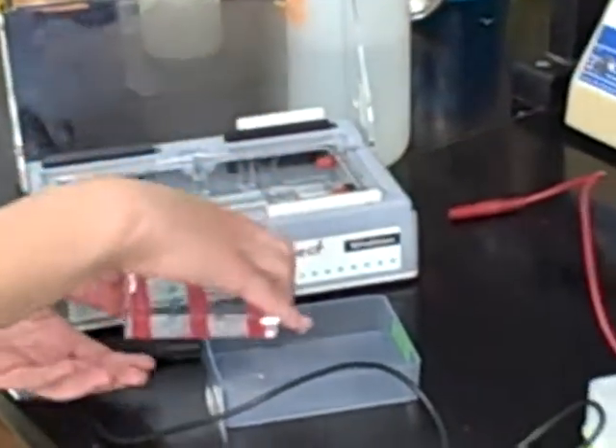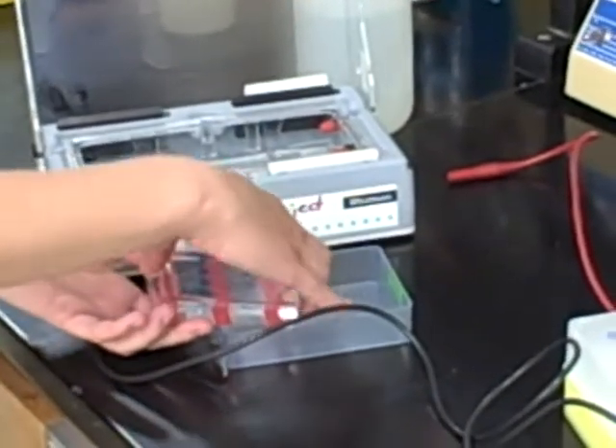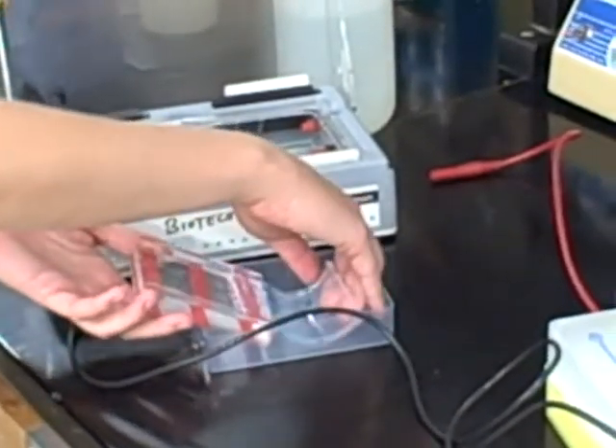Bring the gel and the cast over to the staining box and gently slide the gel into the box and off the cast.